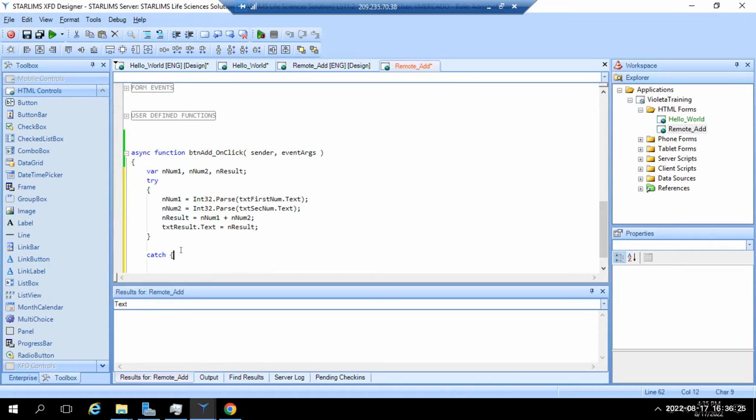So we are over time, and I don't want to keep you guys that long. Let me just finish it off, Violeta. But yeah, nice job. That was pretty much not everything I wanted to show, but we got there at the end. Where the hell is the take control? Sorry. Close this. There we go. Request remote control request.